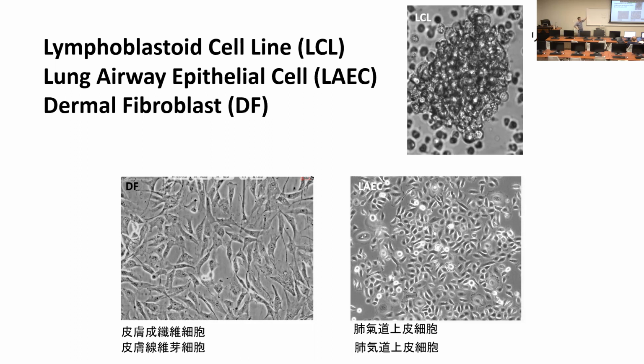They were randomly selected. They were accessible and downloadable, and also very different, so that's why we selected them. You can select basically any cell type you're interested in to study the variability of gene expression. But for this case, we just want to compare using 3 examples from different cell types.